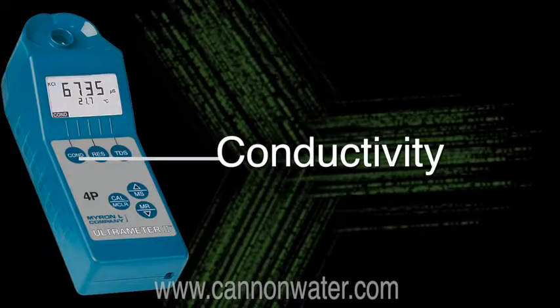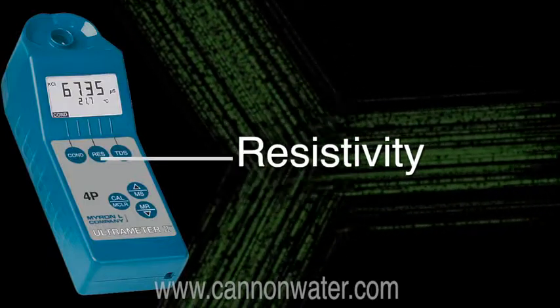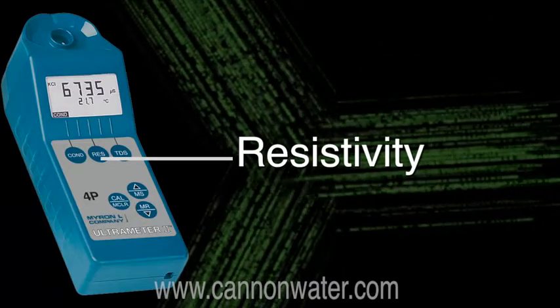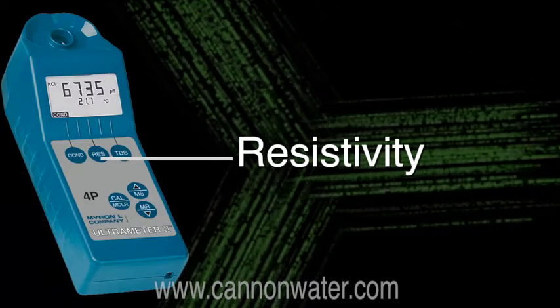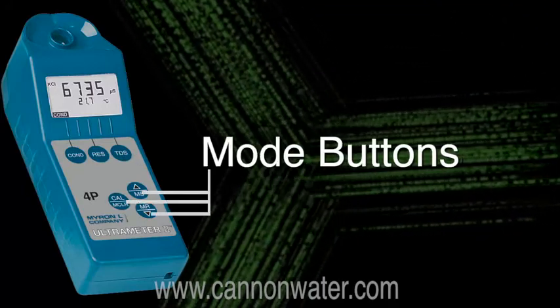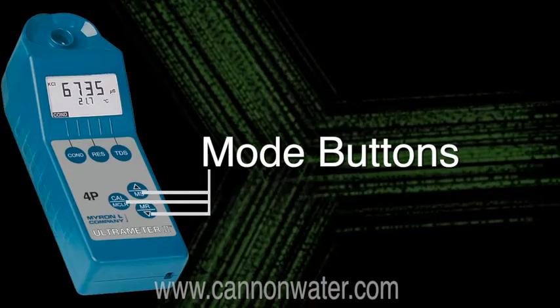The buttons on the Ultrameter are conductivity, resistivity — which is the opposite of conductivity and is the resistance to electrical conductivity in water — TDS or total dissolved solids, and then you have your mode buttons for changing modes or entering in data.